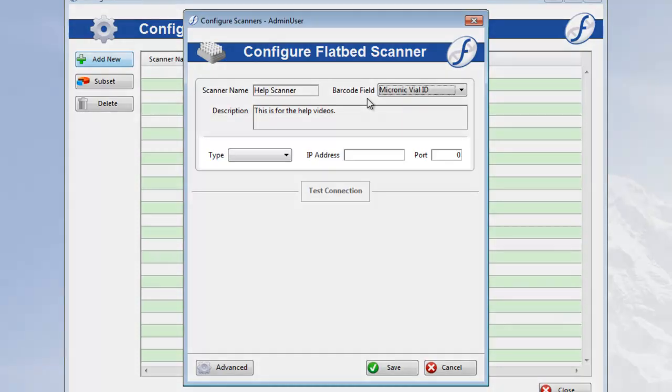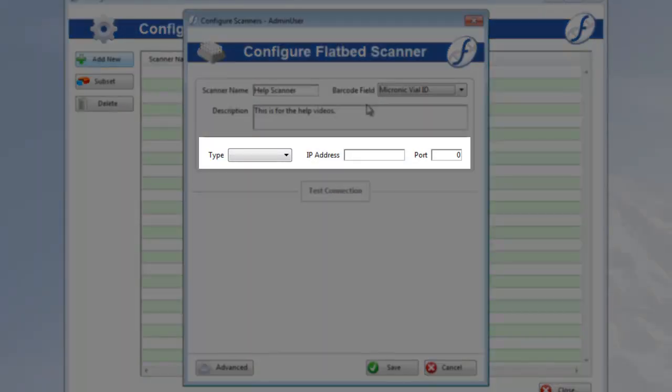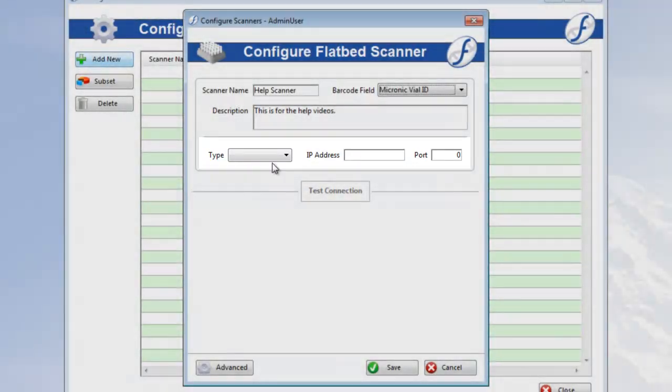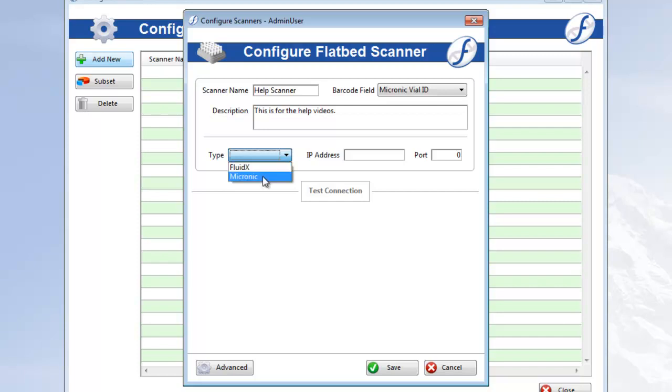Now to the really important stuff. First, select the type of scanner you're using. For the time being, FreezerWorks only supports FluidX and Micronix scanners. Then you'll enter the IP address, the computer name works too, and then the port number.